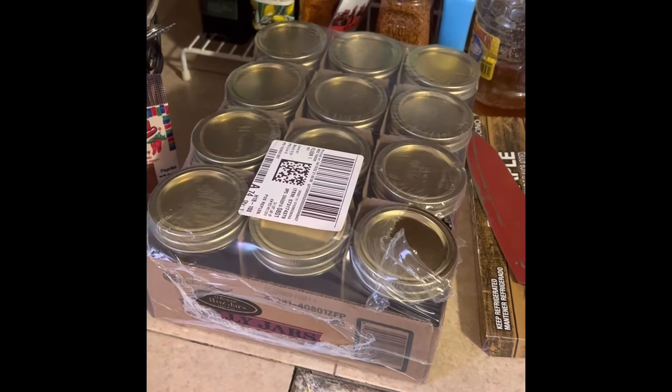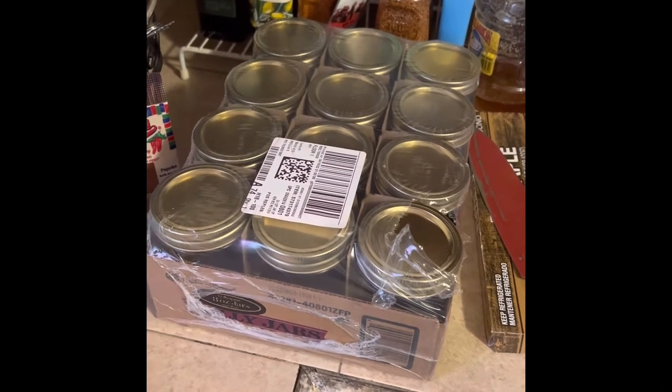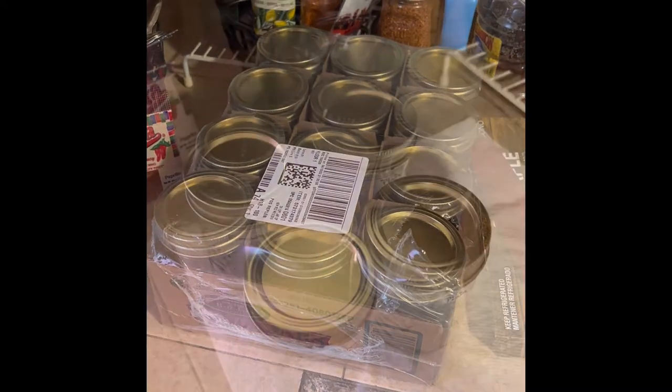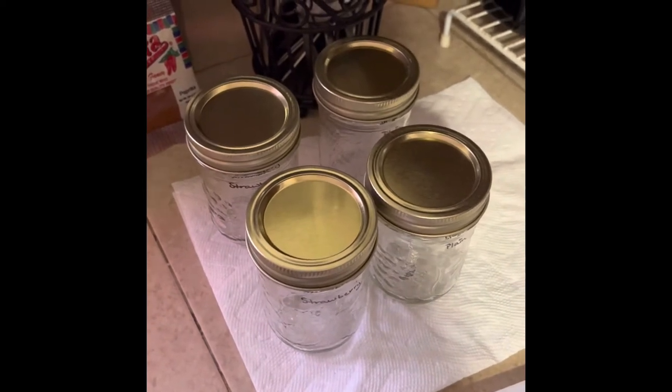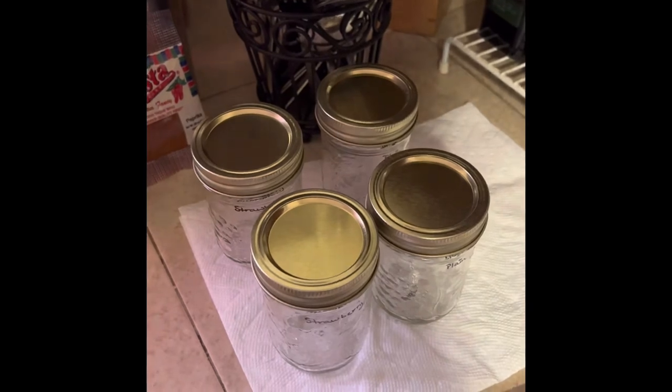Here are my 8-ounce little mason jars that I'm about to boil in a pot of water to sterilize my equipment for my yogurt experiment. After sterilizing the mini mason jars, I labeled 2 of them strawberry and 2 of them plain for the 2 different yogurts I will be using in a little bit.